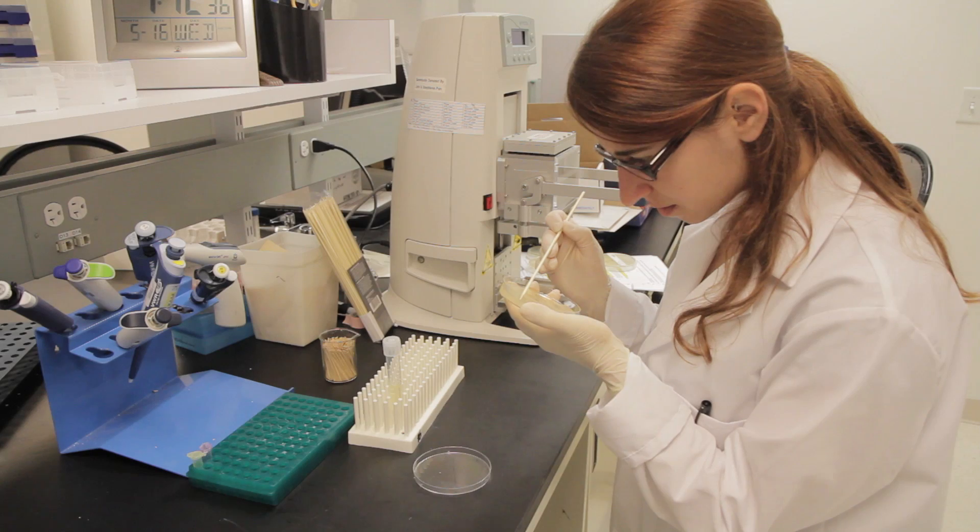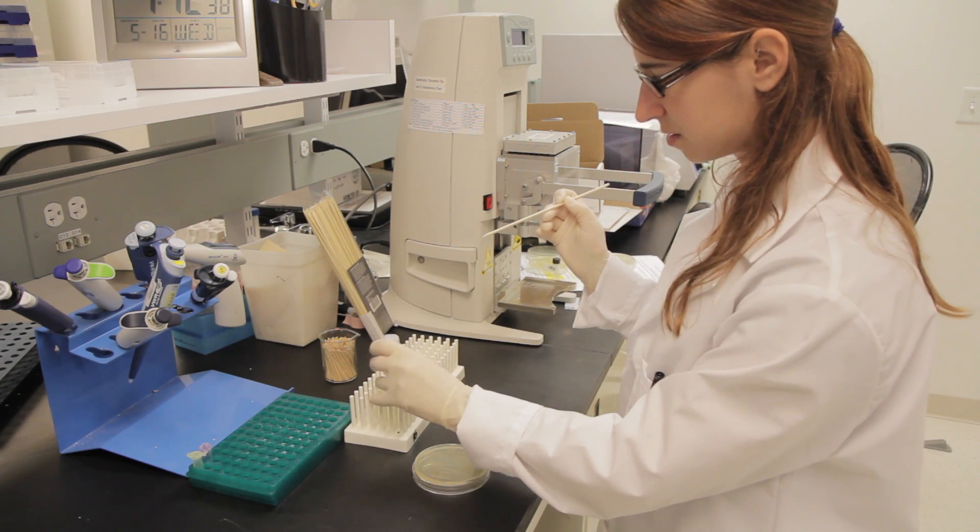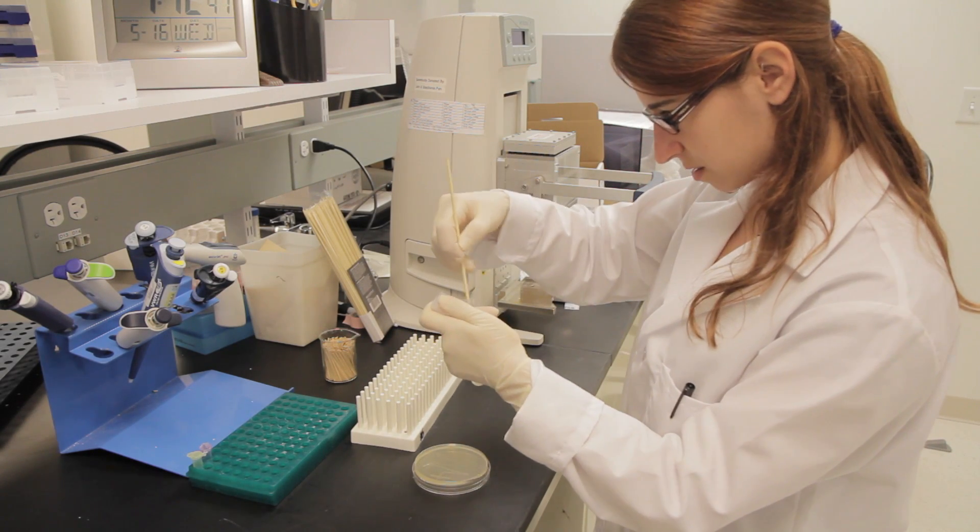From a single colony, inoculate a liquid culture and grow overnight at the conditions suggested on Addgene's plasmid datasheet.